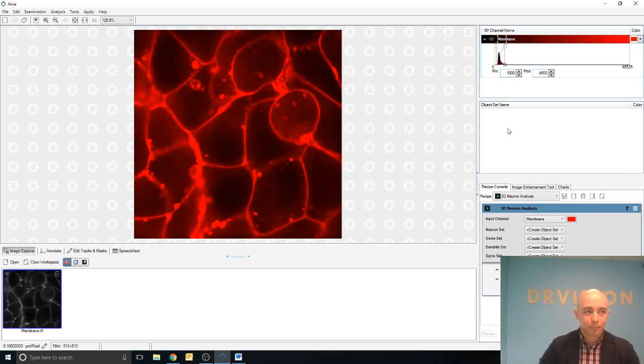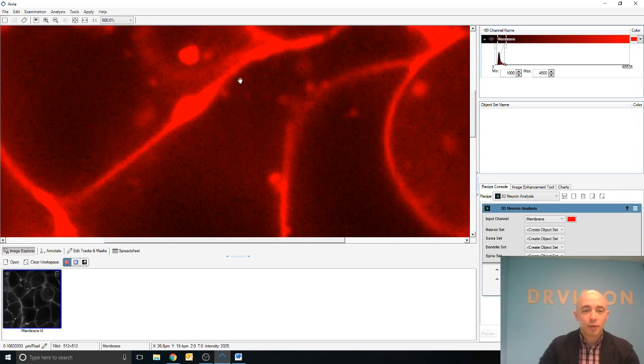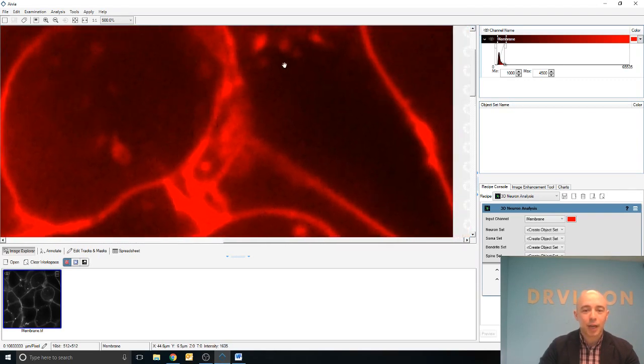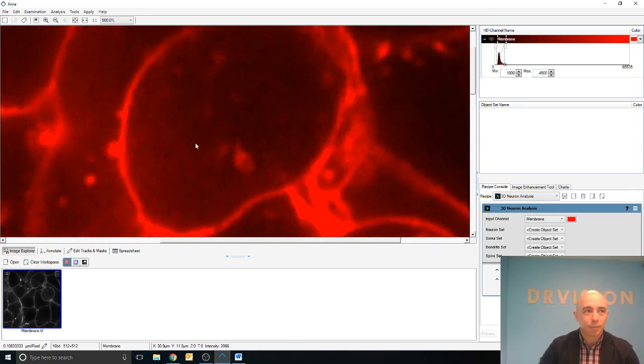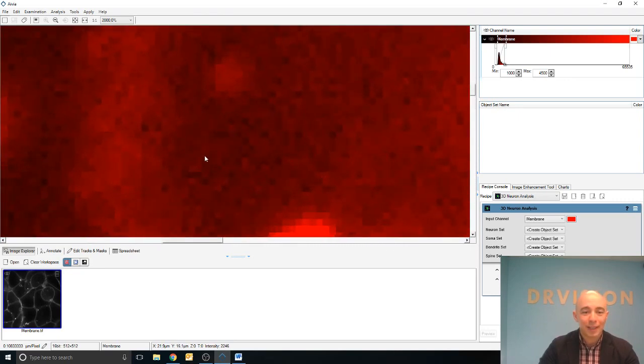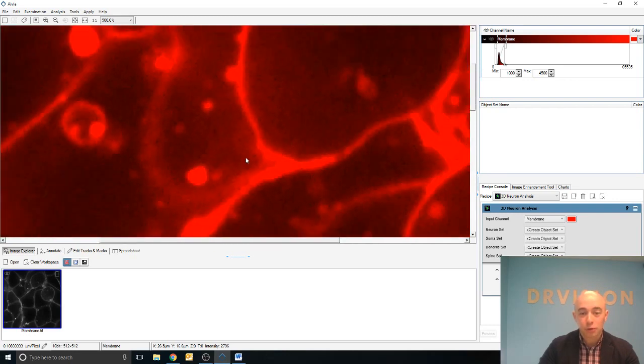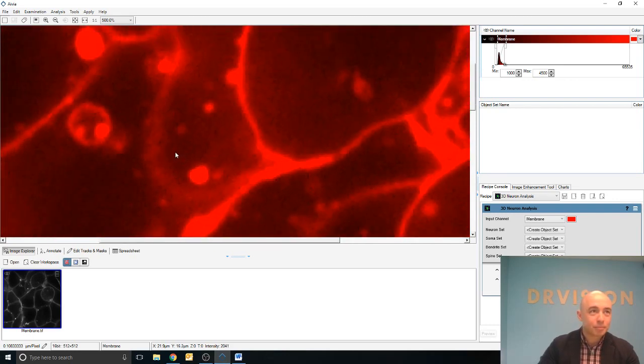Look at that. Now we can clearly see the data in this image. What we have here are some cell membranes. We can zoom in on this image, even pan around to see different areas of the field of view. If we zoom in far enough, we can even see individual pixels, or voxels for three-dimensional images.